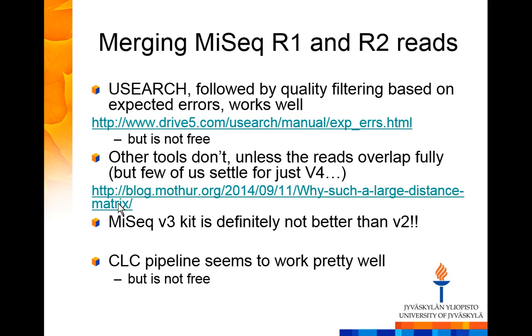At the Fierer lab, we used max EE 0.5, which is very stringent. In the USearch manual, I think they recommend max EE 1, which is still pretty stringent.